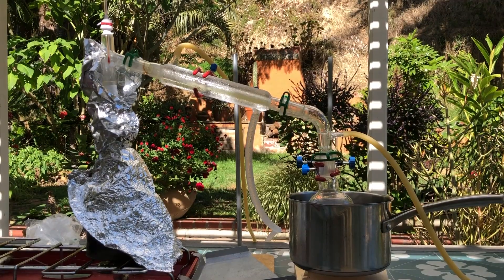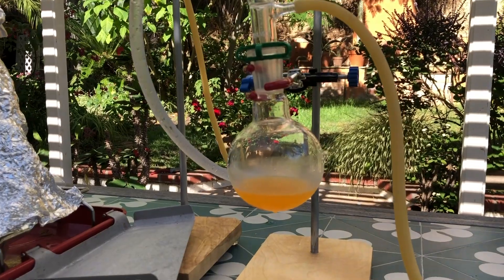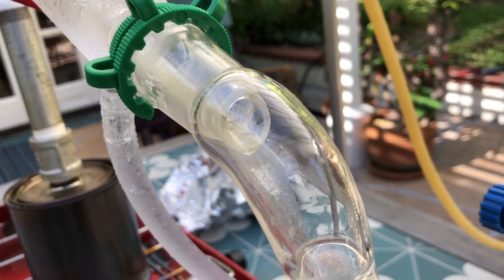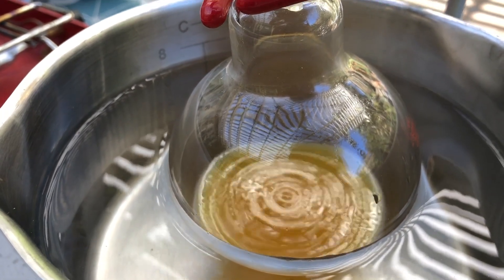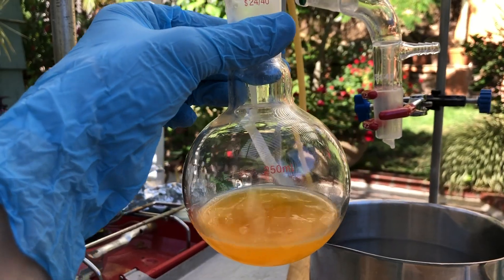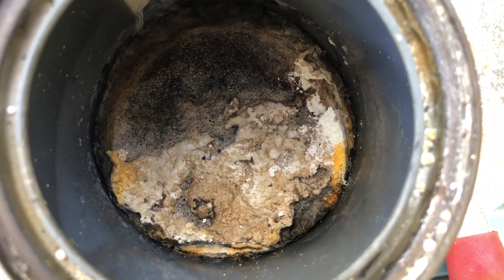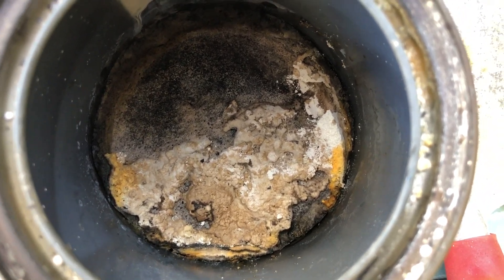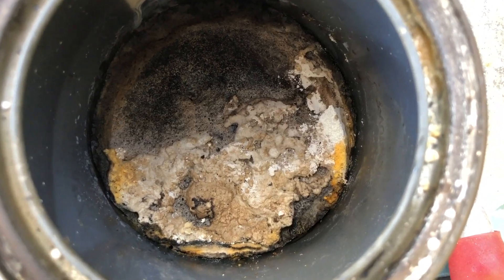I stopped the distillation when little distillate was coming over and whatever did was way past the boiling point of benzene. Interestingly, something froze in the condenser and after I turned the pump off, it began to melt into my flask. I was left with a decent amount of orange liquid. Left inside the can was a gross mess of solids, consisting probably primarily of sodium carbonate, leftover reactants, and whatever came off the paint can.